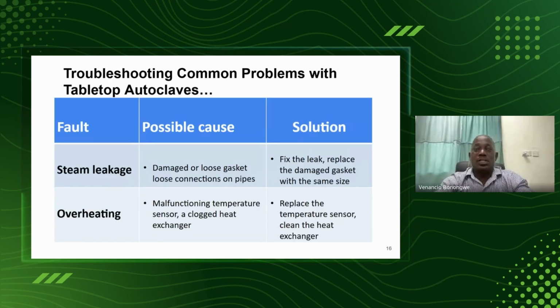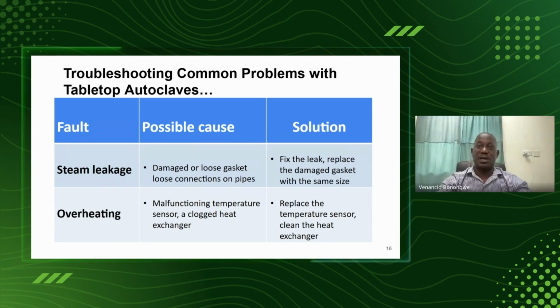Now we are into troubleshooting of the common problems that may occur in our autoclaves. We have a lot of problems that may occur in our autoclaves, but we have selected a few that we commonly encounter in our day-to-day troubleshooting of autoclaves.